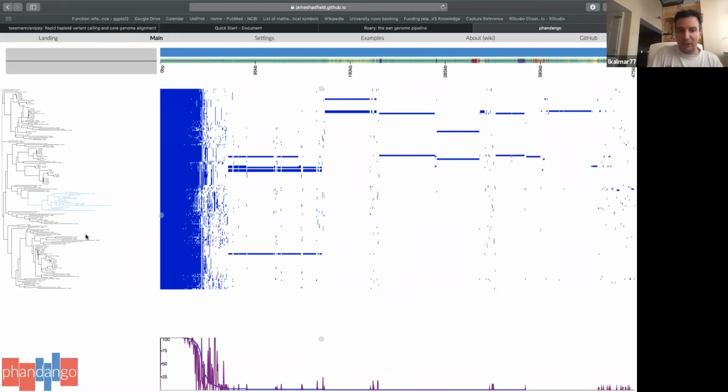But if you click on a specific branch like I did, and this is now blue, I hope you can see it's blue, it's very small, then you have an extra graph here in purple. And the purple peak here means that within the selected branch, this gene is represented 100%. And this is exactly the line of this one.